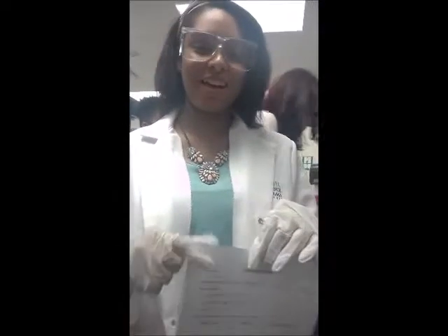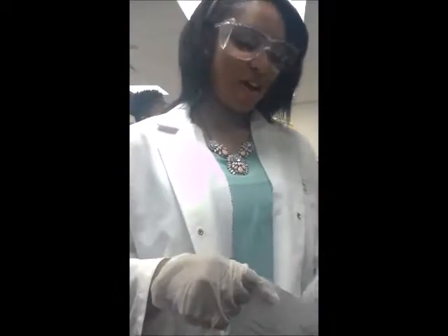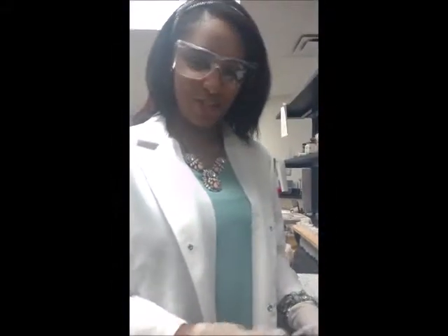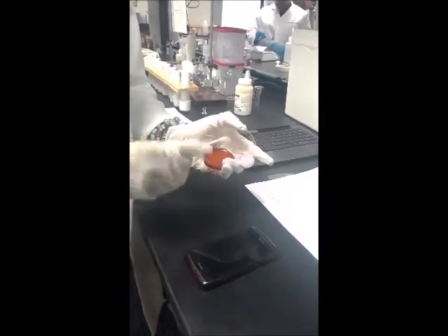I'm Ambriel August, and this is my partner Tiana Leca. We are doing our project on bacteria on phones. Here I have the human consent form, and here I have the participant's phone. I will be swabbing the phone and placing the swab onto the plate. Swabbing techniques include streaking the phone as so.